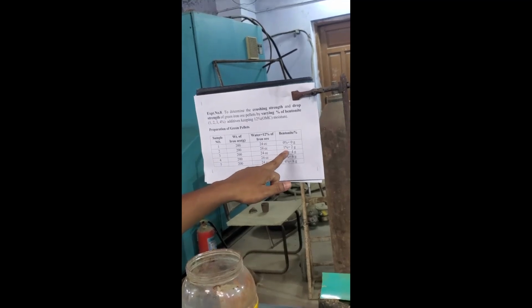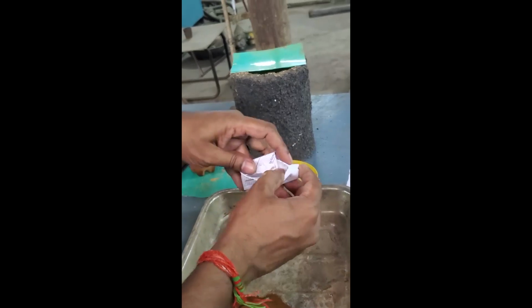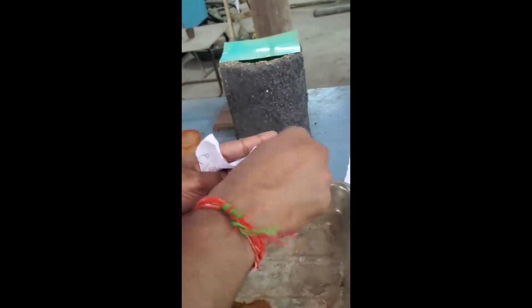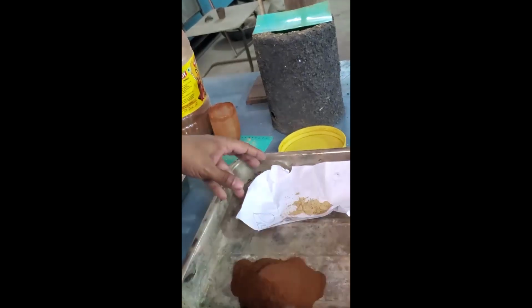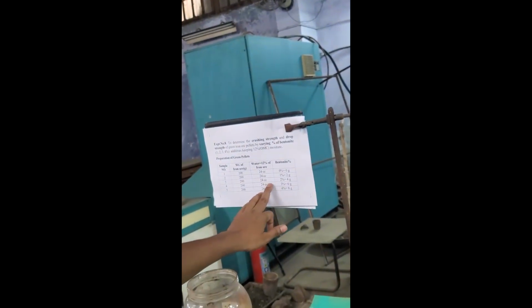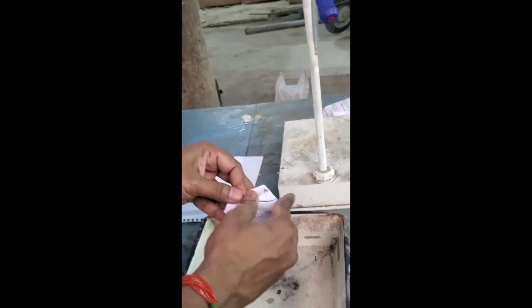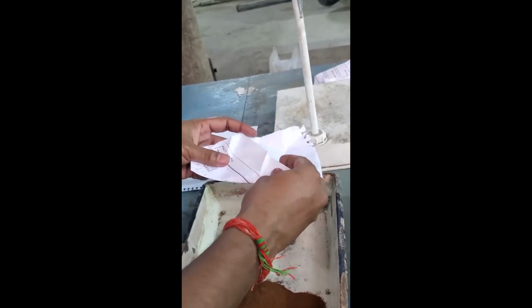Bentonite, how much do we require? 2 grams. We already weighed this bentonite with the help of the digital balance. Now 2 grams of bentonite is ready to mix. This is the 2 grams bentonite. So, in the third sample, 200 grams iron ore and 2% of bentonite, that means 4 grams. Here, 4 grams, you can see bentonite is there. It is already weighed.